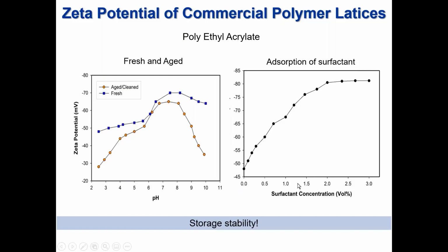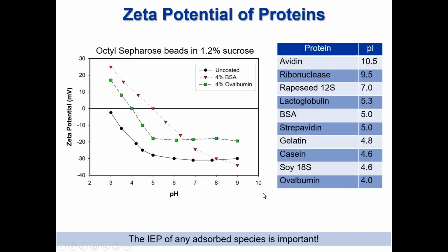thermal action. There's great renewed interest in proteins, but it is important to know their isoelectric point, and I show some data for proteins adsorbed onto the surface of octyl sepharose beads. We can see that the zeta potential profiles of the coated beads is completely different from the bare uncoated beads. So what we're measuring is the zeta potential of these two proteins.